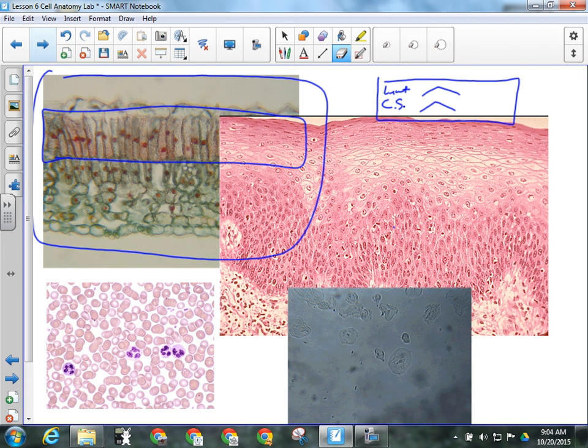There are structures you should be able to see, and there are ones you shouldn't be able to see. All right, like you're not going to see ribosomes. Don't label them; they're too small. You'll never see them. All right, but you could probably see things like rough ER. Okay, I would say that this over here, where it's kind of just a light pink shading, that's probably smooth ER. I would say that this little deal right here in the corner is most likely a Golgi apparatus. Okay, things like that. So, I mean, I'm not saying use your imagination, but use your imagination a little bit.